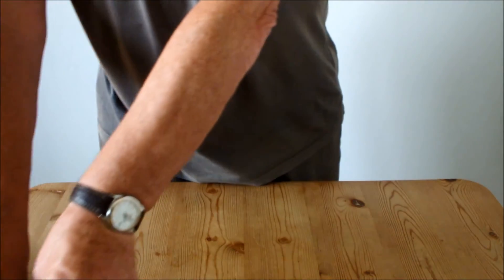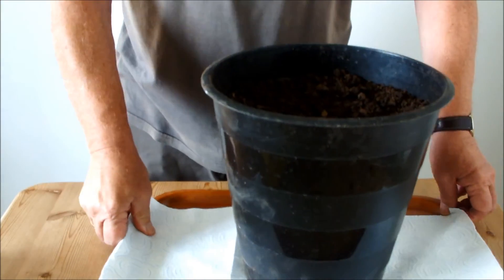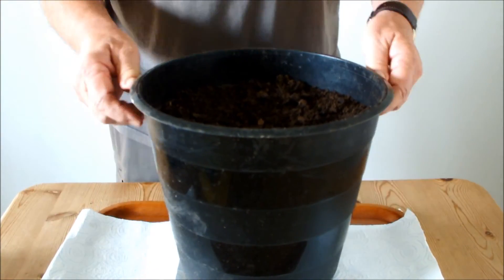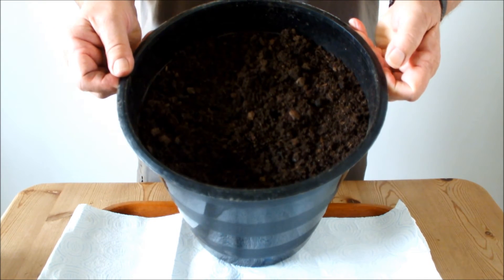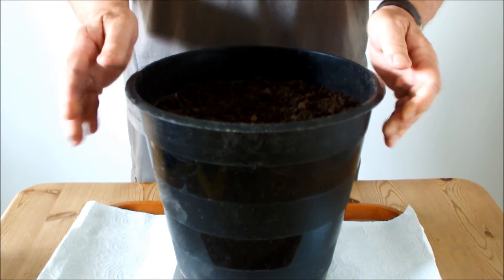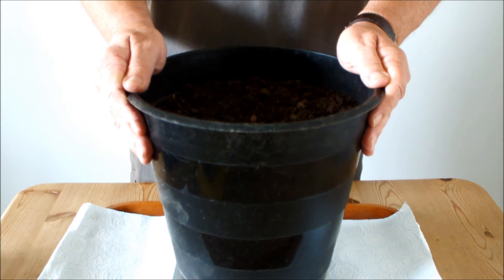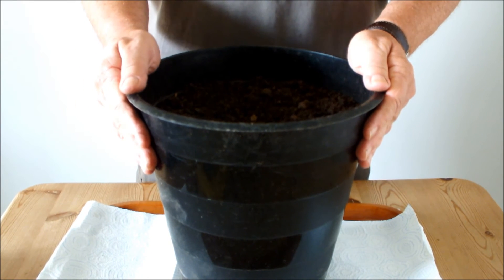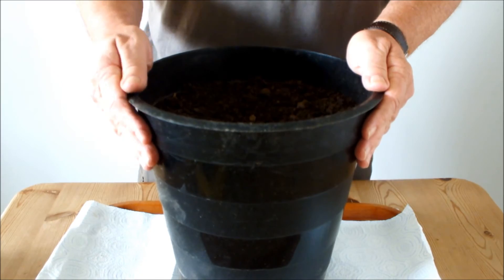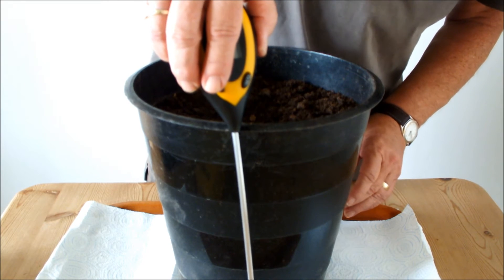I've just filled this 10-inch pot with compost from the raised bed. This should be reasonably representative. What I will do is go around the raised bed and check the pH level at lots of different locations, then make an adjustment accordingly if I need to. But just to demonstrate these meters to you, this should do fine. You can see the length of this probe — it's going to go down nearly to the bottom of this pot.